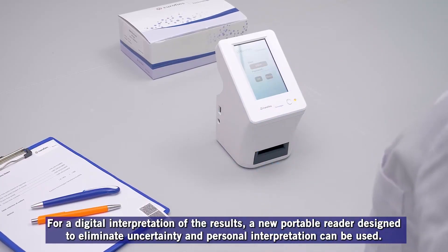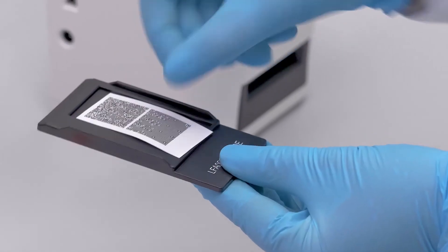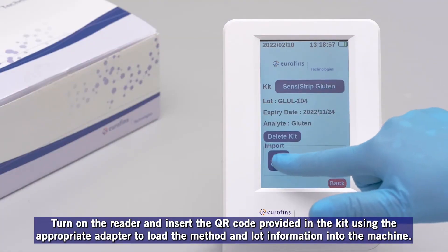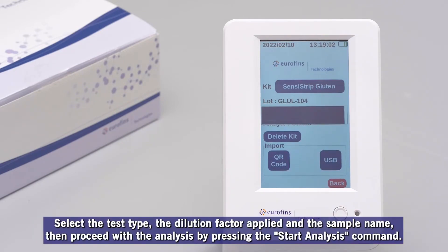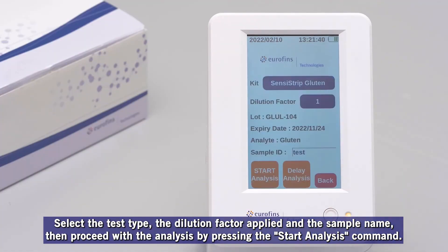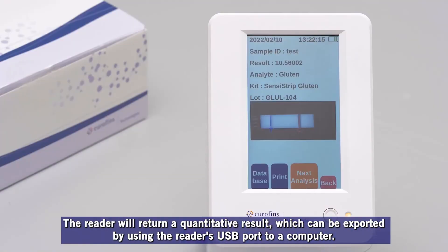For a digital interpretation of the results, a new portable reader designed to eliminate uncertainty and personal interpretation can be used. Turn on the reader and insert the QR code provided in the kit, using the appropriate adapter to load the method and lot information into the machine. Select the test type, the dilution factor applied, and the sample name. Then proceed with the analysis by pressing the Start Analysis command. The reader will return a quantitative result, which can be exported via the reader's USB port to a computer.